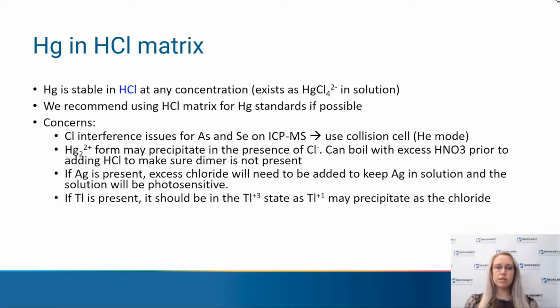Some concerns for using an HCl matrix though, again, there is that chloride interference for arsenic and selenium if you're analyzing those on mass spec. So we recommend using helium mode or the collision cell to break up these interferences if you are analyzing those two elements.